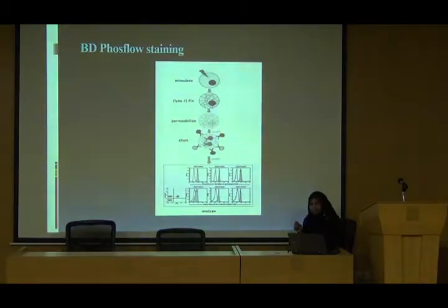So you can say for one tube, according to the parameter you are studying, you can check, say, in one cell, three different proteins, or you can check one protein in three different cells. Say you can check, okay, if AKT pathway is phosphorylated, I can check AKT in the whole lymphocyte, or even in the whole granulocyte, or in monocyte. And also, if I have room for a surface receptor, I can select just neutrophil and check if AKT is phosphorylated there, or I can check just CD19 B cell and see if AKT is phosphorylated on that cell based on my activation, yes or no.